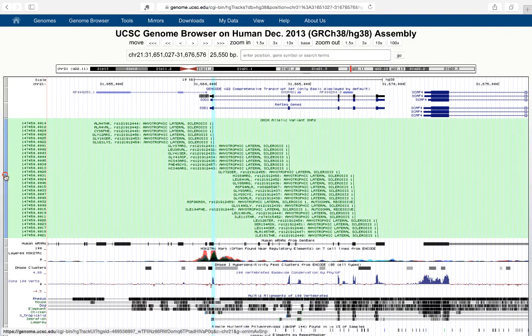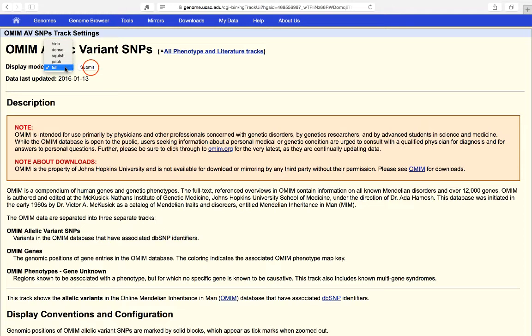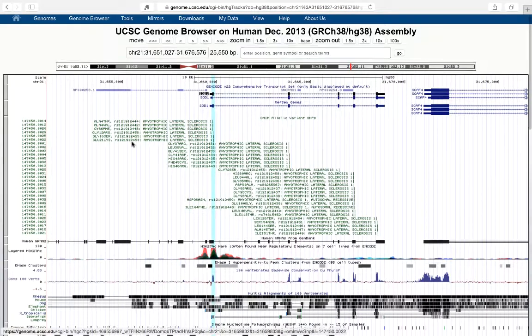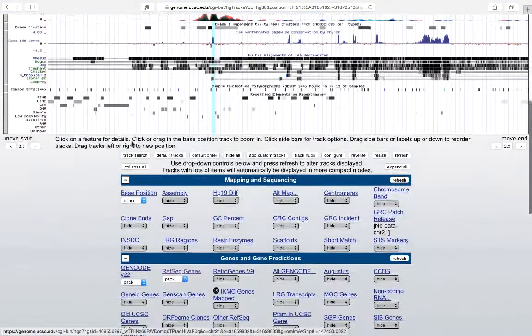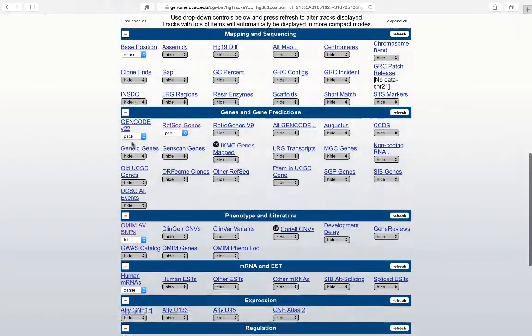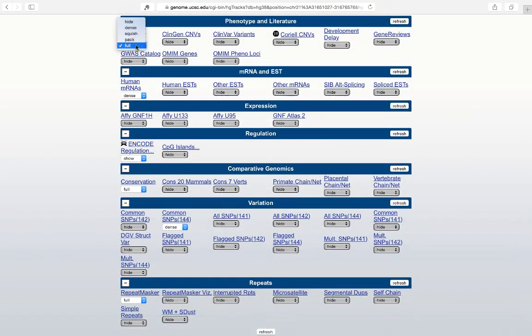You can also change the view from the display mode in the track information page, or we can scroll down and select from there.